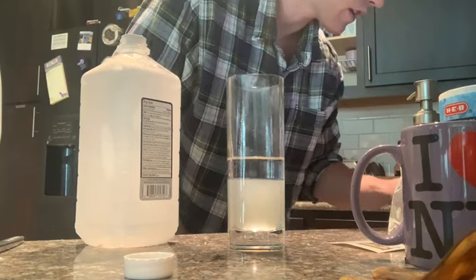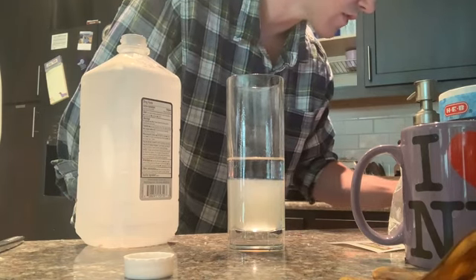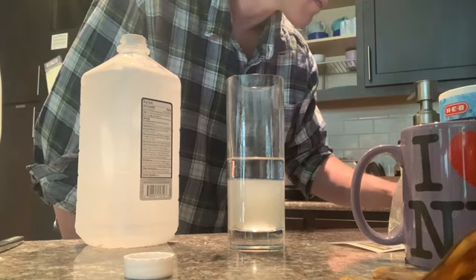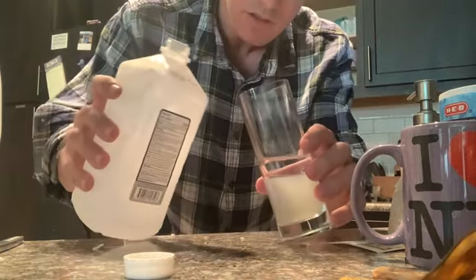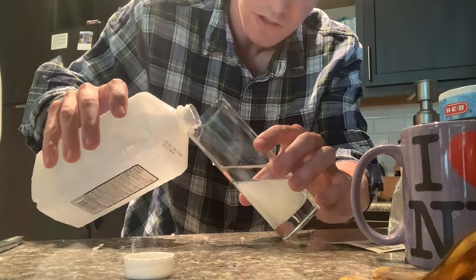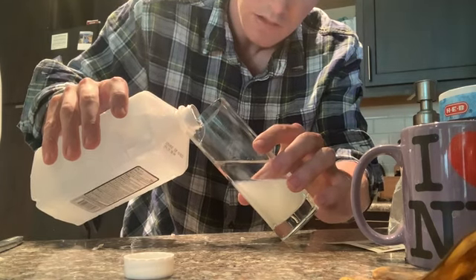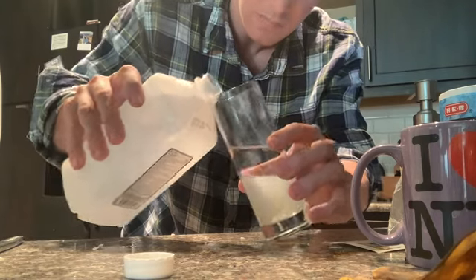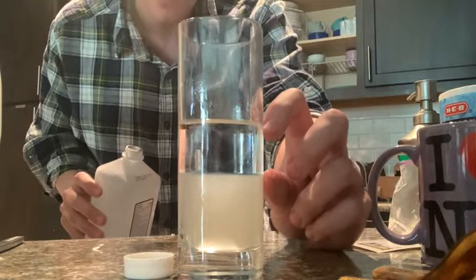Cool. Let's see, how much am I supposed to add of that? It doesn't really tell me how much I'm supposed to add. So, well, it does say about 1 inch high. So I'll just keep adding a little bit more, again, slowly getting against the rim edge, until you get about 1 inch separation. Nice. Do you see that inch separation on top of the water?